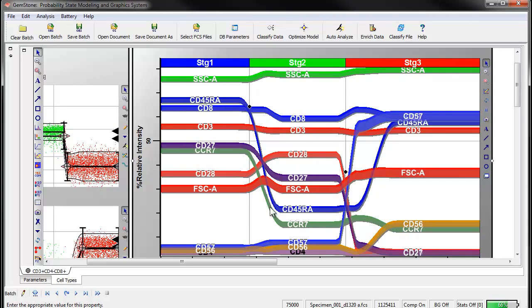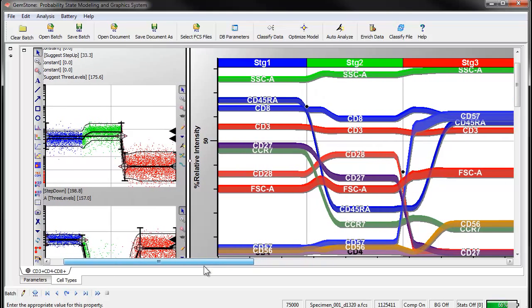So at this point, it has staged the data, and you can see that it actually ends up simplifying the look of the overlay because the labels are now just in the middle of the stages, instead of what we call our wire labeling mode.